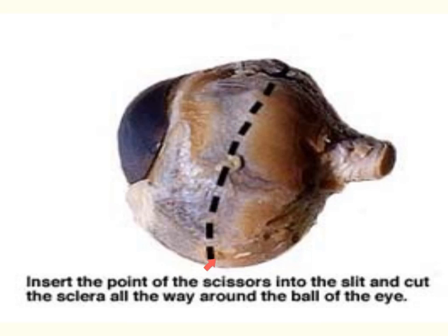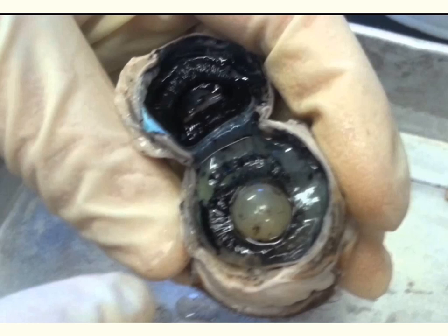As you open the eye you're going to see a thick jello-like material — that's the vitreous humor, which helps keep the eye's shape intact. You're also going to see a round structure, and that's the lens of the eye. If you take the lens out and try to smash it with your probe, it won't squish — it's hard, but it will break into little strips of pure protein fibers. Notably, the lens is the only part of the body that cannot get cancer.